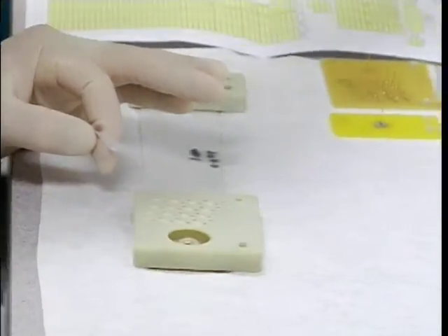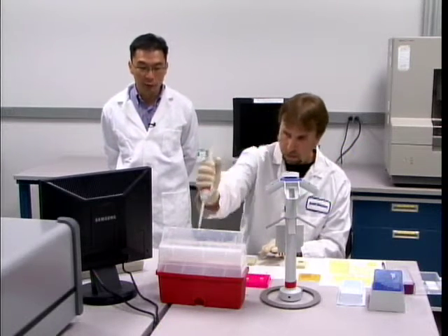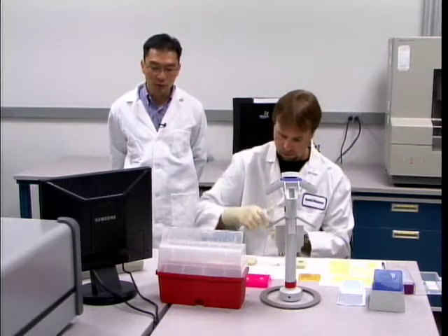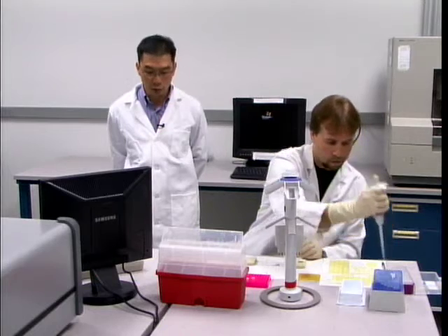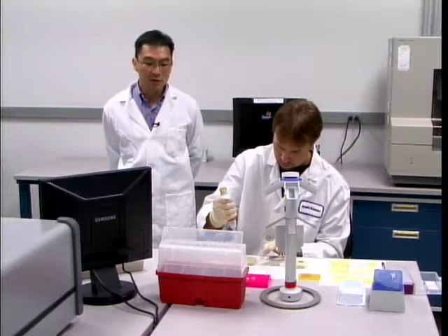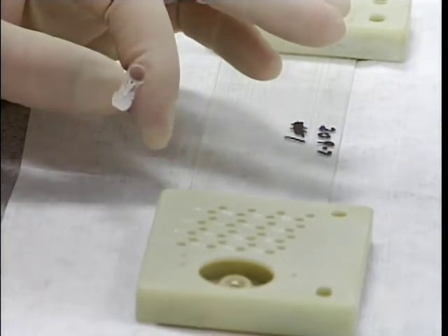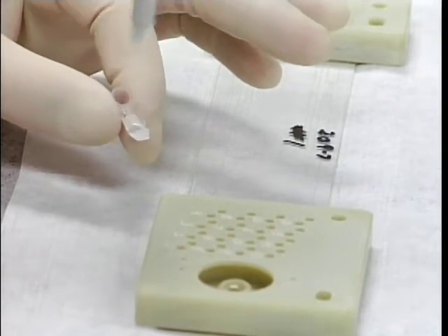As discussed earlier, the GeneBench FX Series 100 is the separation and detection portion of the fully integrated instrument. Since we are only using this portion, manual handling of the chip with respect to loading of buffers and samples is required. For the fully integrated system, microfluidics will be used to move fluids from the DNA processing portions — extraction and PCR — into each of the separation channels on the chip.